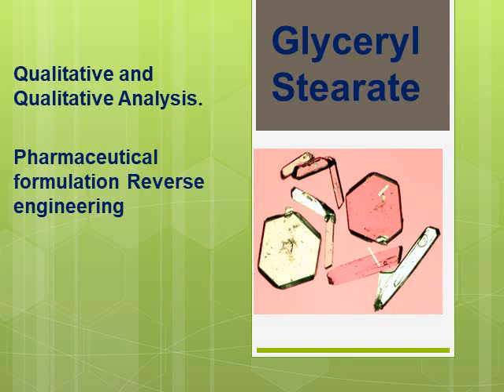Hello everyone. Today I'm going to talk about Glyceryl Stearate, and I'm going to talk about the qualitative and quantitative analysis of this excipient in pharmaceutical dosage form. This video is beneficial for people who would like to do pharmaceutical reverse engineering and figure out how much Glyceryl Stearate they have in their formulation.